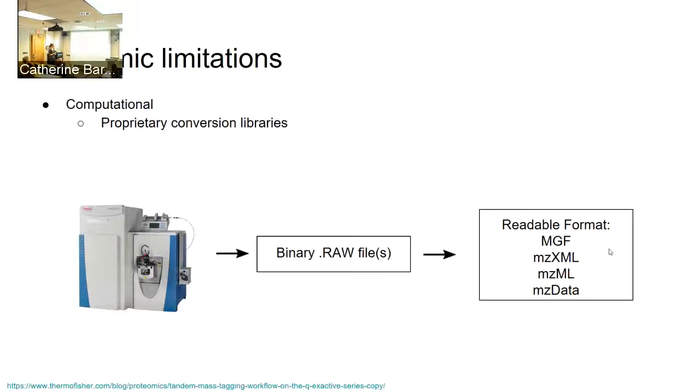Another one of these, and this is kind of a pet peeve and a sad truth, is that proteomics has a heavy bent towards graphical user interfaces. And I totally understand, you want to know your audience. A lot of times these softwares are being used by people who are not computational, and so they're not comfortable working in a command line. The only problem that I personally have with that, given that I'm trying to build a pipeline, is that sometimes these tools have no command line interface that's accessible, or it's very difficult to access one. And as a result, trying to pull everything together into a unified pipeline has been a bit of a piece of work, and I'm still working on it.